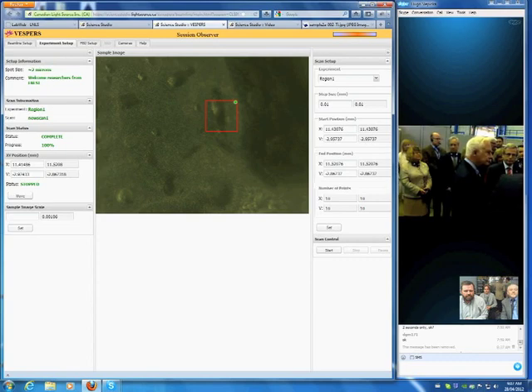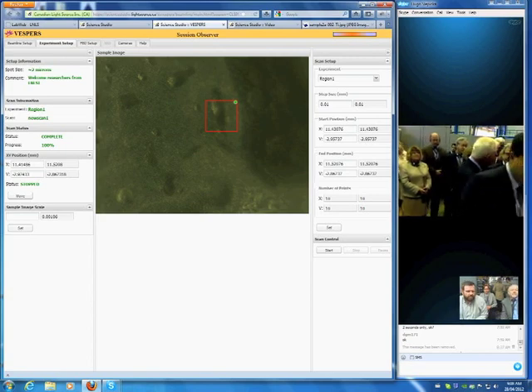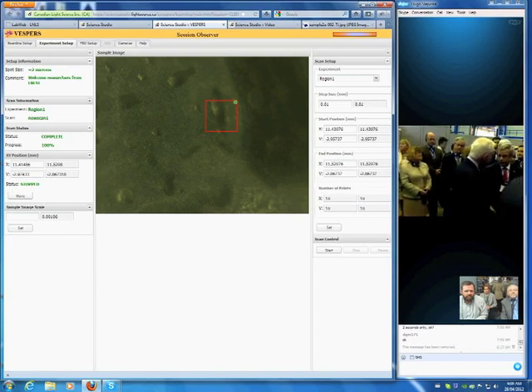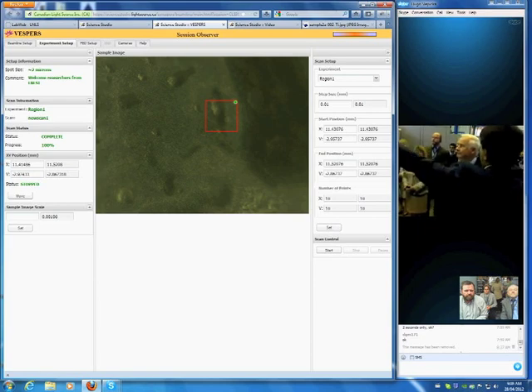Exactly. And so once we started to do this, we still have the system working here on the Science Studio, but what we will do is use the Science Studio to control the beamline there in Saskatoon. So now we're going to pack Science Studio. You can see there, it is in Canada. Ready? We are now controlling.